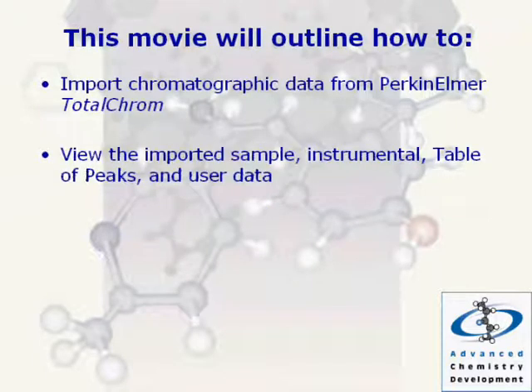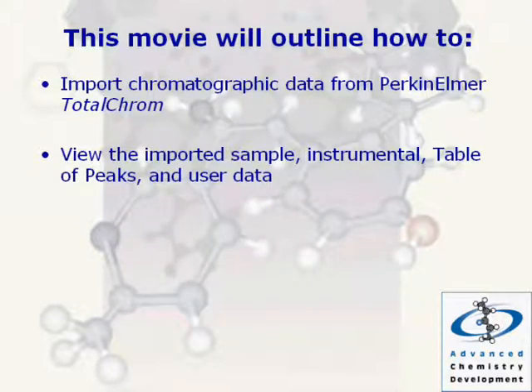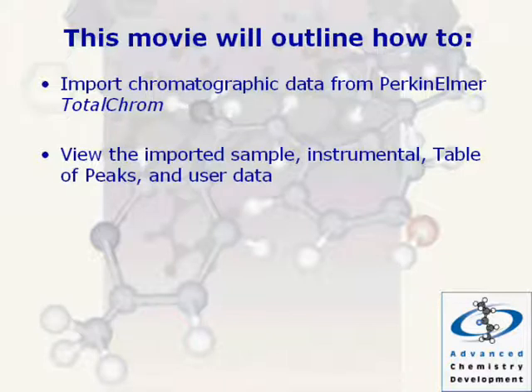This movie will outline how to import chromatographic data from Perkin Elmer Total Chrome and view the imported sample, instrumental, table of peaks, and user data.